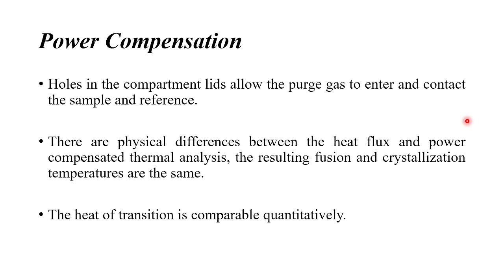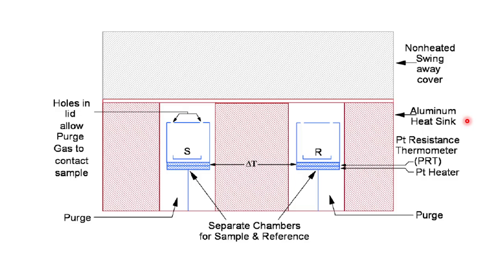There are physical differences between the heat flux and power compensated thermal analysis. The resulting fusion and crystallization temperatures are the same. The heat of transition is comparable quantitatively. So this is basically a schematic diagram of a power compensated DSC.